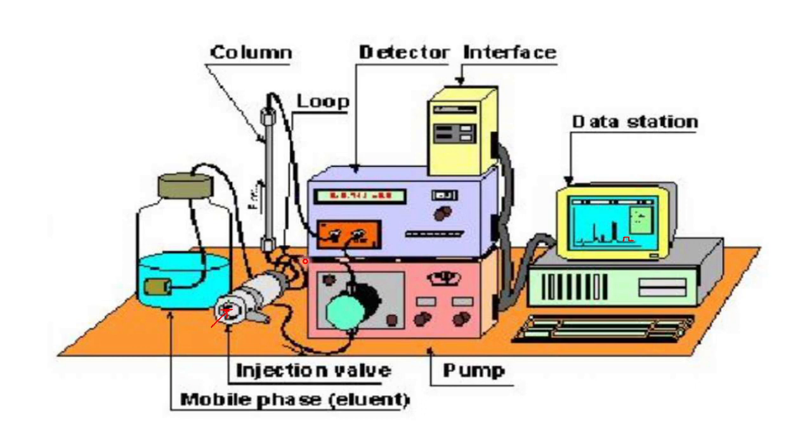So in all this, the game of separation happens in this particular column and is detected in the detector. So basically we need to keep in mind that the protein is injected through a particular valve and it stays inside this loop region. Okay, and then when we pass the buffer through it, it just pushes it through this column and helps it to elute at different rates. If it's a larger molecule, it elutes faster. If it's a smaller sized molecule, then it elutes at the end of the curve.